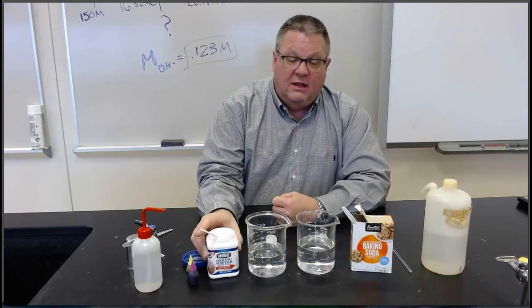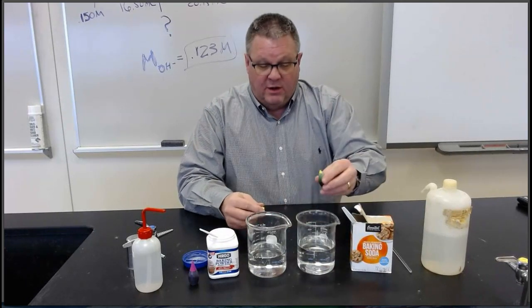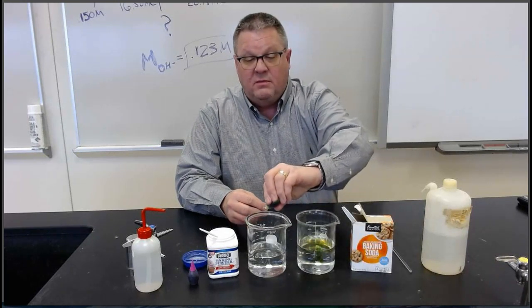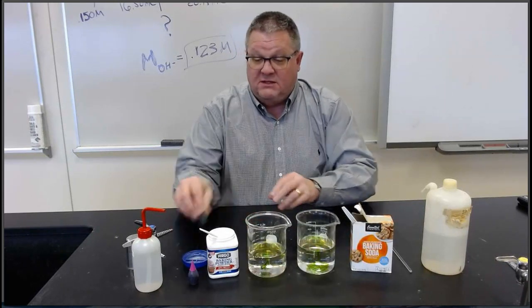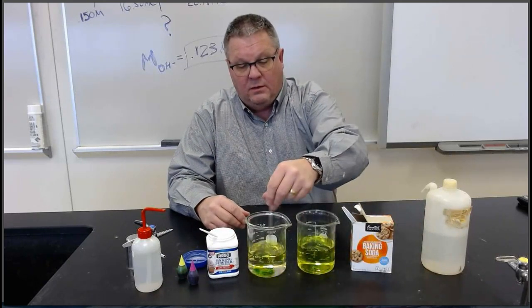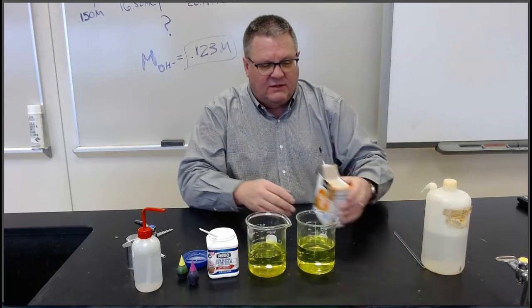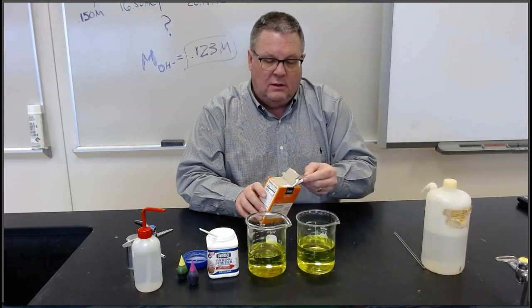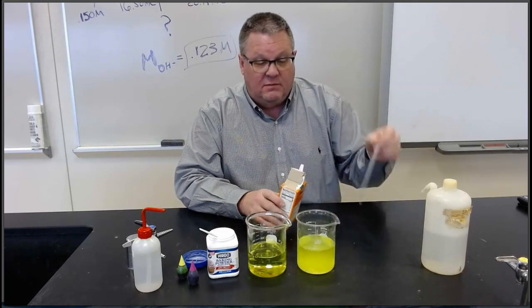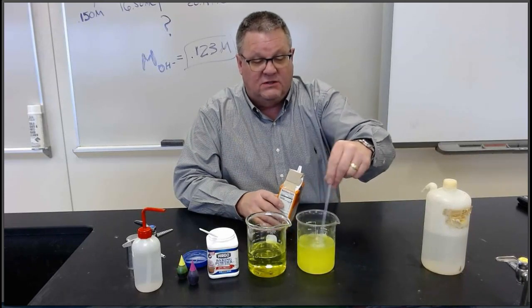All right, let me show you what I'm talking about. These are 2 beakers of just water. I'm going to add just a little bit of food coloring to them. So hopefully you can see bubbles. And with the baking soda just being a base, you would expect to not see really any bubbles formed when it's just dissolved in water.